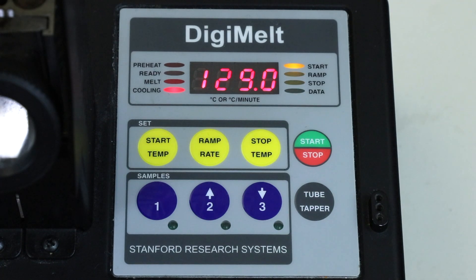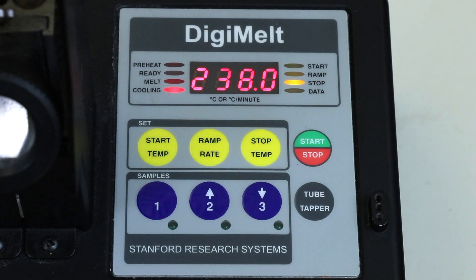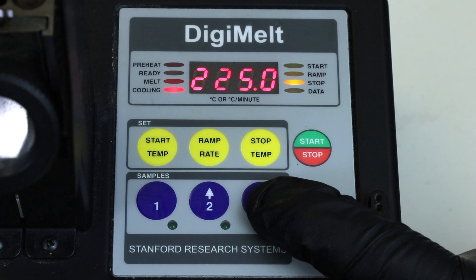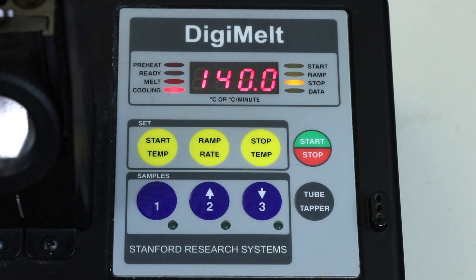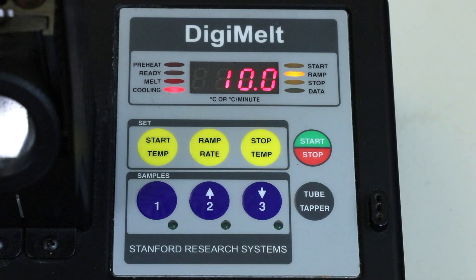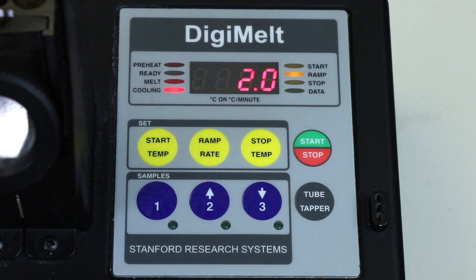Once the starting temperature is set, check the stop temperature — it just needs to be above the literature melting point value, but in case you forget to stop the apparatus once the product has melted, set it just a few degrees above. In this case I'll put it at 140 degrees Celsius. Also check the ramp rate; you don't want the metal heating up so quickly that you get a really wide melting point range, so two degrees per minute is a good rate.